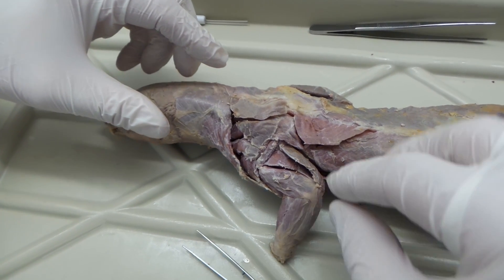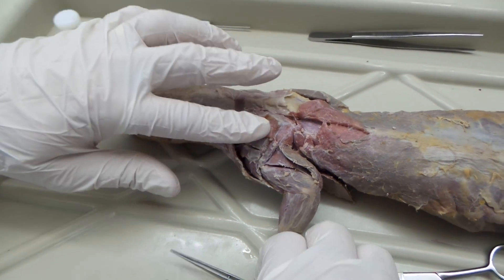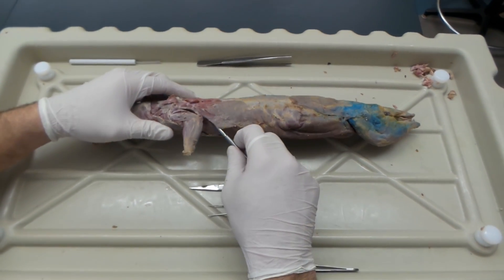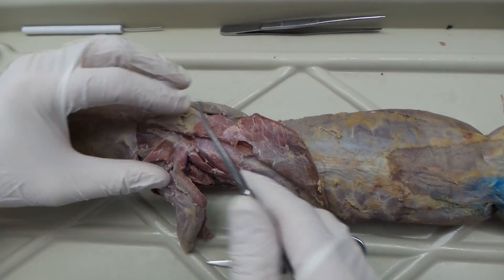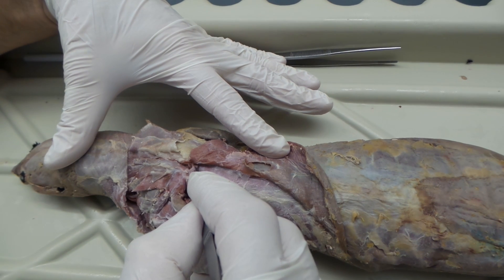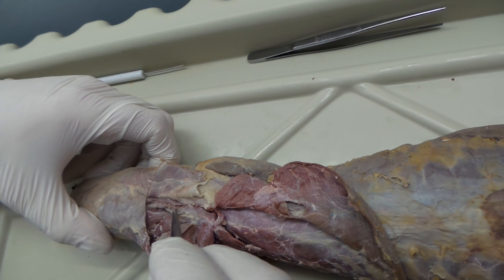Now you're going to want to lift those trapezius muscles to see what's below. All of this is the latissimus dorsi — I lifted it and held it back. Attached right along the top, you have the rhomboideus muscles. The rhomboideus major runs right down to the edge of the scapula. Here's the top of your scapula. Then we have the rhomboideus minor, with a nice little line right here.